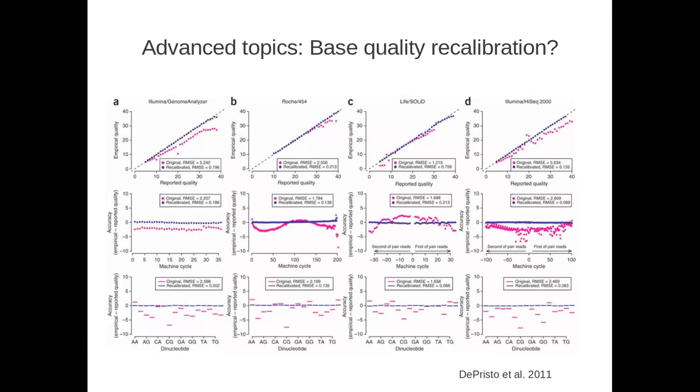And one of the things that came out of having those true positive data sets is realizing that the error probabilities are actually wrong. So remember, we've talked a lot about Phred qualities and how in your raw FASTQ data each individual base has a Phred quality score, which can be converted to the probability of that individual base being an error or called incorrectly by the algorithm that processes the raw data coming off of, say, an Illumina or a SOLiD sequencer.